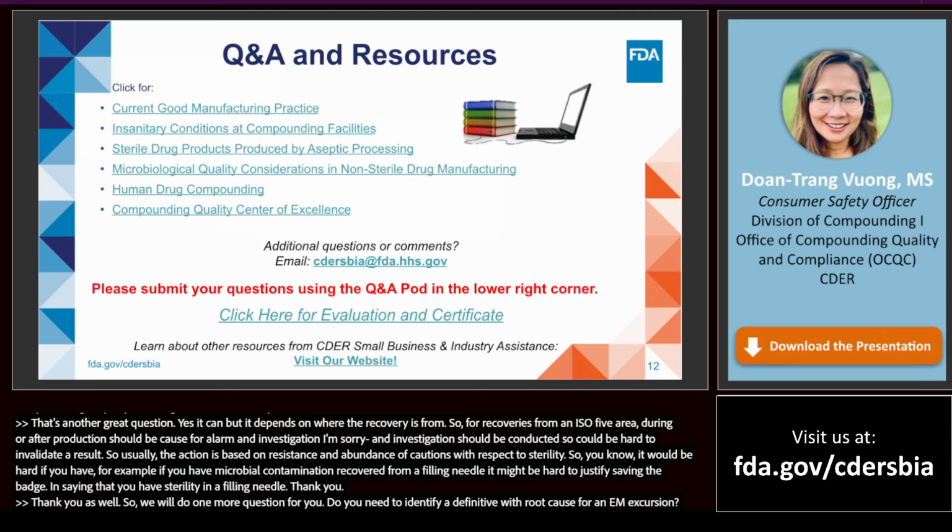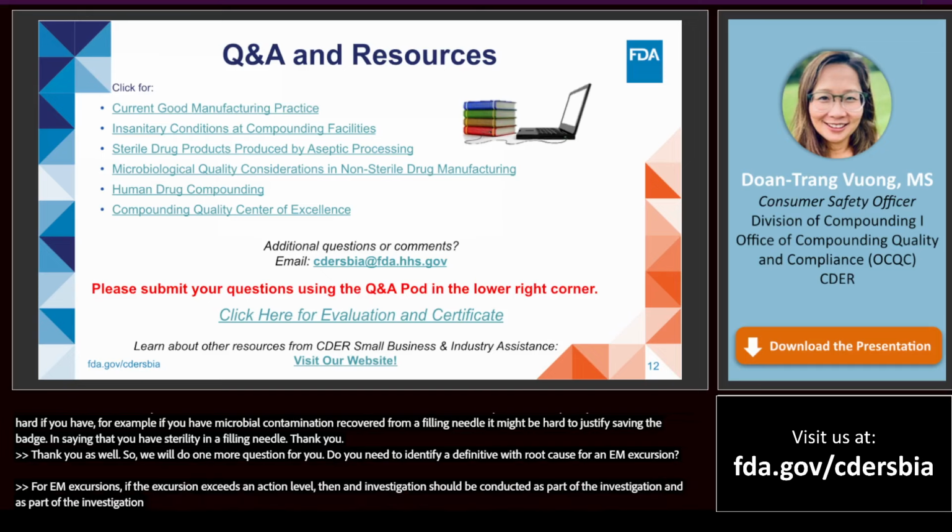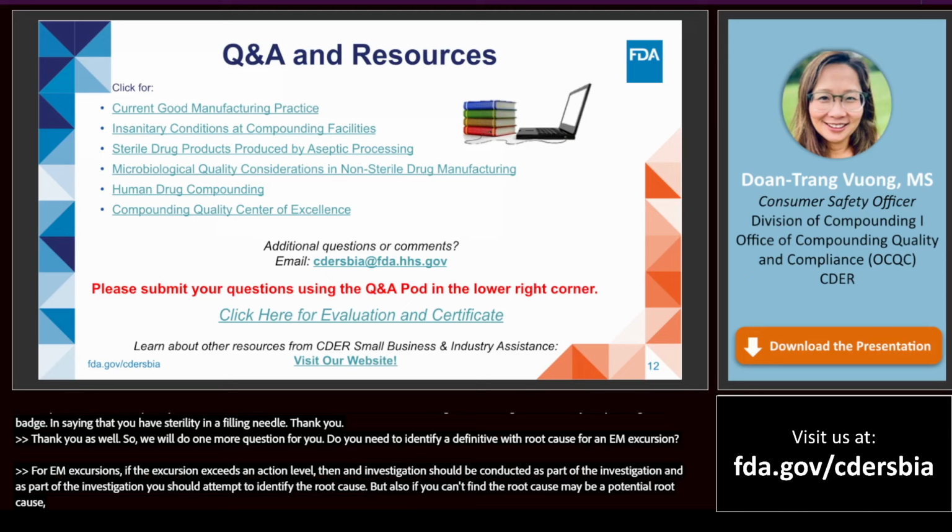So for EM excursions, if the excursion exceeds an action level, then an investigation should be conducted. As part of the investigation, you should attempt to identify the root cause. But also, if you can't find the root cause, identify a potential root cause, as the root cause for an EM excursion may be difficult to identify.